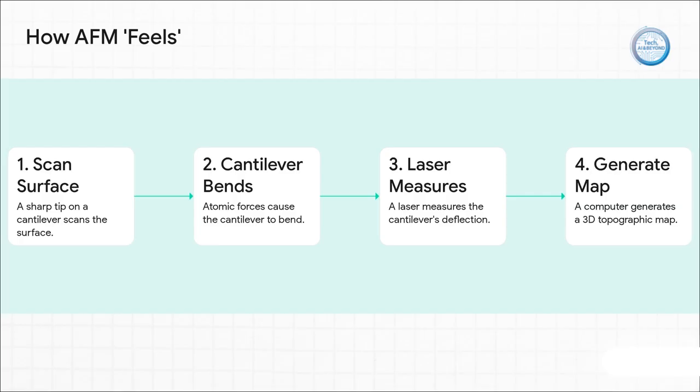That's just brilliant engineering. So what are the big advantages of using an AFM instead of an electron microscope? I've also heard it can do more than just map the shape. AFM has some game-changing advantages. The biggest one is that electron microscopes need a high vacuum to work, but an AFM can operate almost anywhere, in the air or even completely submerged in liquid.